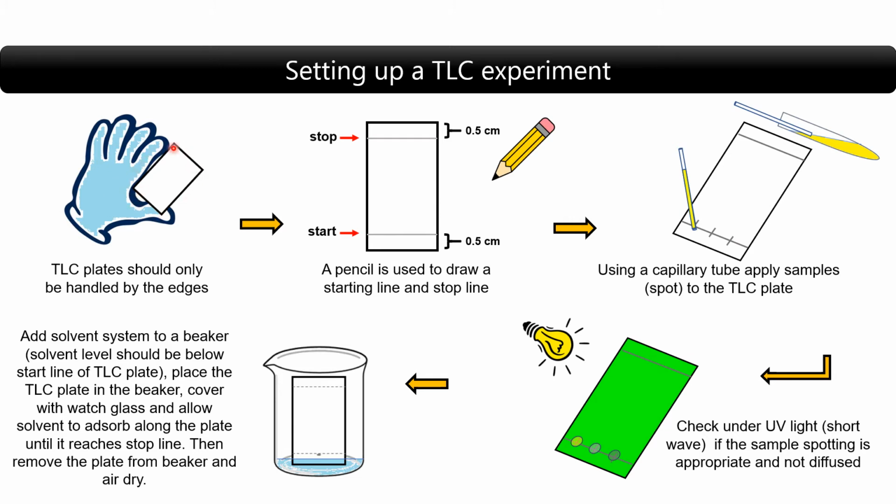We handle the plate only by edges, and then using a ruler and a pencil, we would mark a starting line and a stop line about 0.5 centimeters from the bottom of the plate and 0.5 centimeters from the top of the plate.